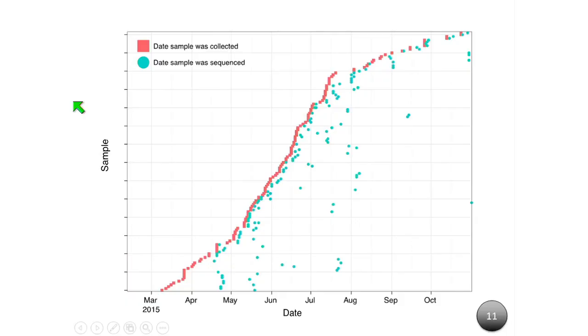So the big opportunity here, and I think you have to use your imagination. If you're only interested in human stuff, you wish I'd stopped talking about pathogens. You have to think, you can do this on human stuff as well. And so the opportunity for the real-time sequencing is that you are taking a single flow cell for a single sample, and you're using it until you get the answer. So imagine that applied to a human sample.